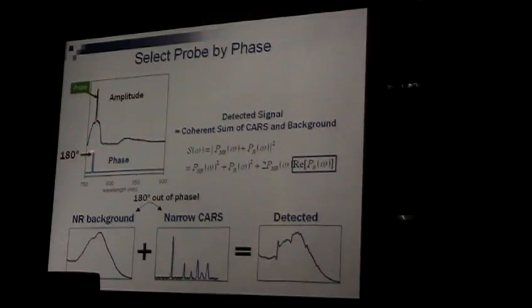Still, most of the signal you will see is like that. But there is a component probed by this one, and now this interferes completely 180 degrees off from all the other ones. So you have something like this, right?